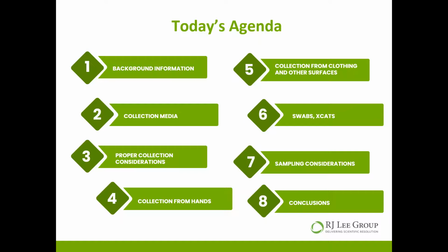I think in my time of analyzing and collecting gunshot residue samples, I've collected from some pretty interesting samples, anywhere from pianos and door jambs to clothing and yes, even underwear. So lots of fun things I've collected from over the years.